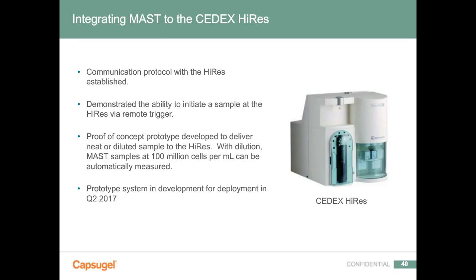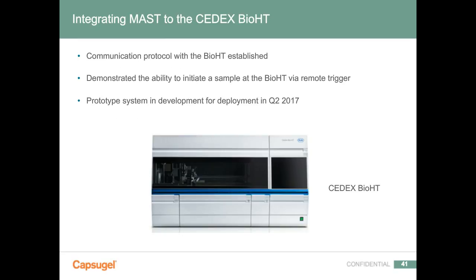Similarly, we're also working with the same client on an integration of the BioHT, and that communication protocol has also been established. And we've demonstrated the ability to sample the BioHT via a remote trigger. And again, we're going to be delivering this prototype solution in the second quarter.